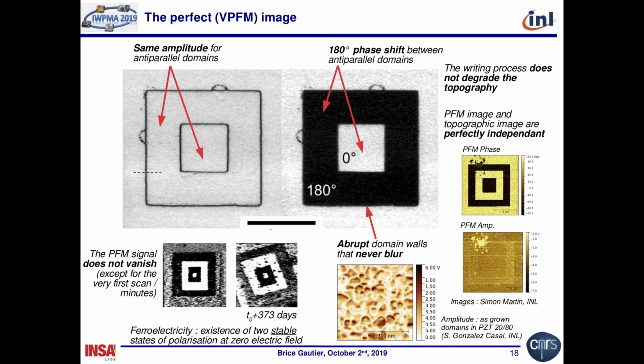If you are confronted with real ferroelectric samples, it lasts. This sample has been imaged for more than 1 year. This is the same area, and you see that what we have written on the surface is still there. So remnance is very important to evaluate the PFM image. It's a sample from Sylvain Delambras.